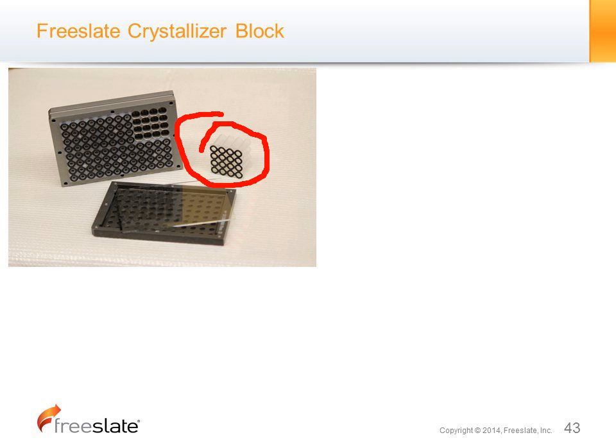Okay, great. I have a clarification on the question that was asked regarding the milling technique. The question is the milling by vortexing, and can you remind us what the RPM you used was? It's definitely milling by vortexing. I should maybe have shown a video of the vortexing itself, but sometimes the video showing can be a problem.